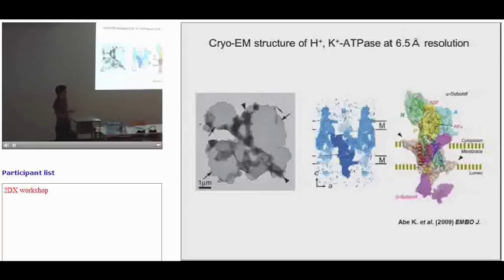So as you imagine, this crystal is supposed to be sensitive to drying, and so in the back injection method, the specimen can be easily collapsed because of specimen drying.